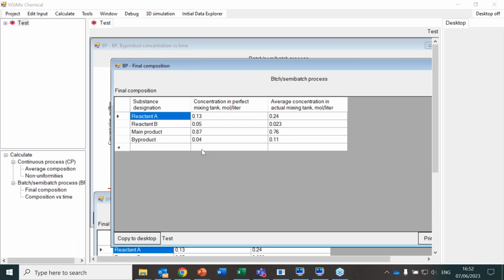A question from Cliff. Thank you very much for being with us. It is not quite clear to me which parameter reflects the difference in solution between scales, say from a 400 liter to a 4,000 liter vessel, to reflect the non-ideal effects.